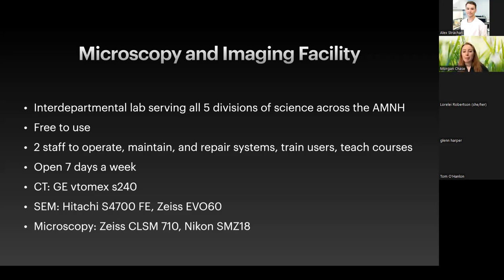And then we have our light microscope, which shockingly was the absolute last addition to the lab. Up until then, all we had were fancy microscopes. We didn't have a basic light microscope. So this is our stacking microscope, which is really popular. So that's the overview of the lab.